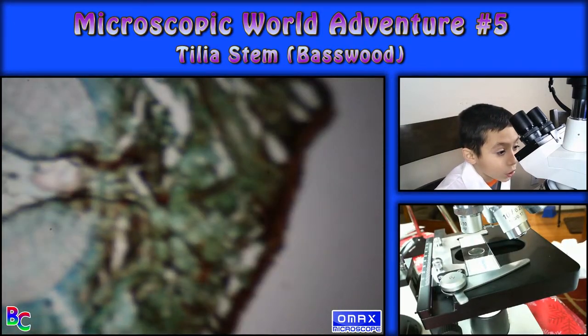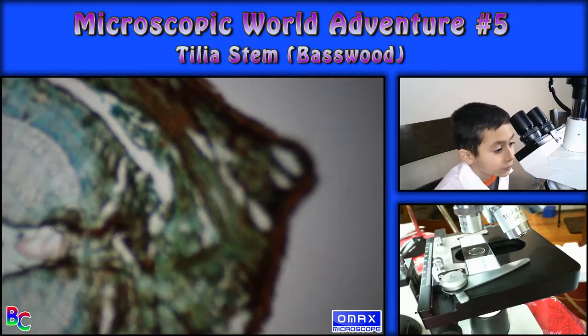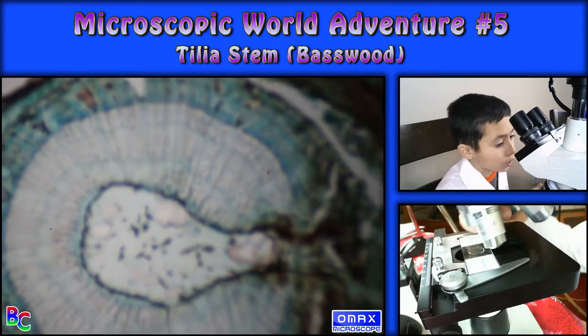I want to get a close up of this. It sort of looks like a fish or something. What are those dots?